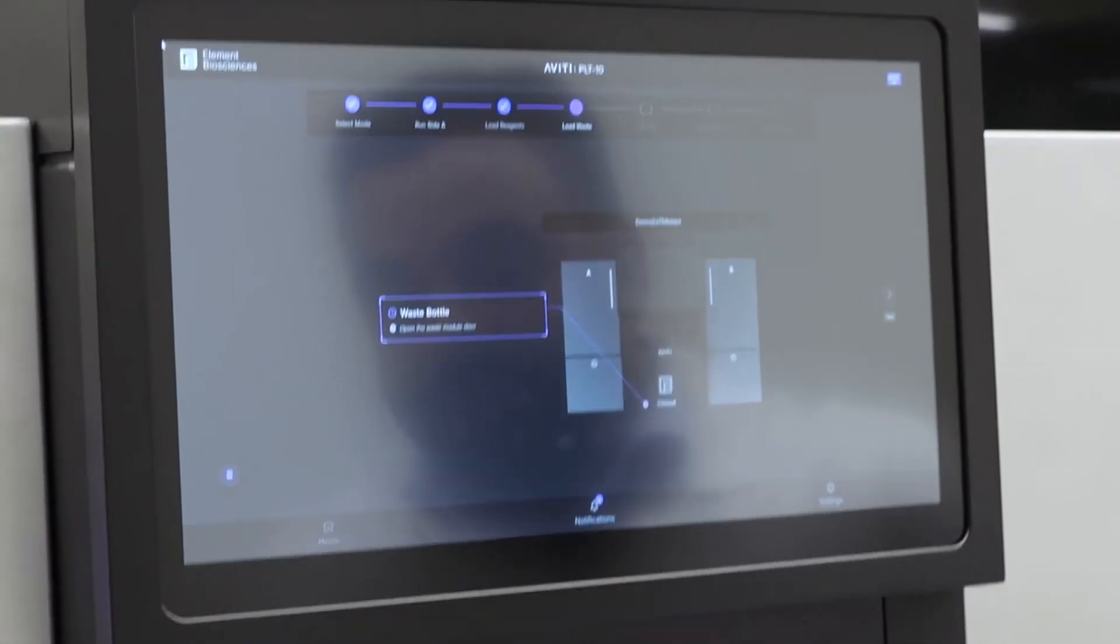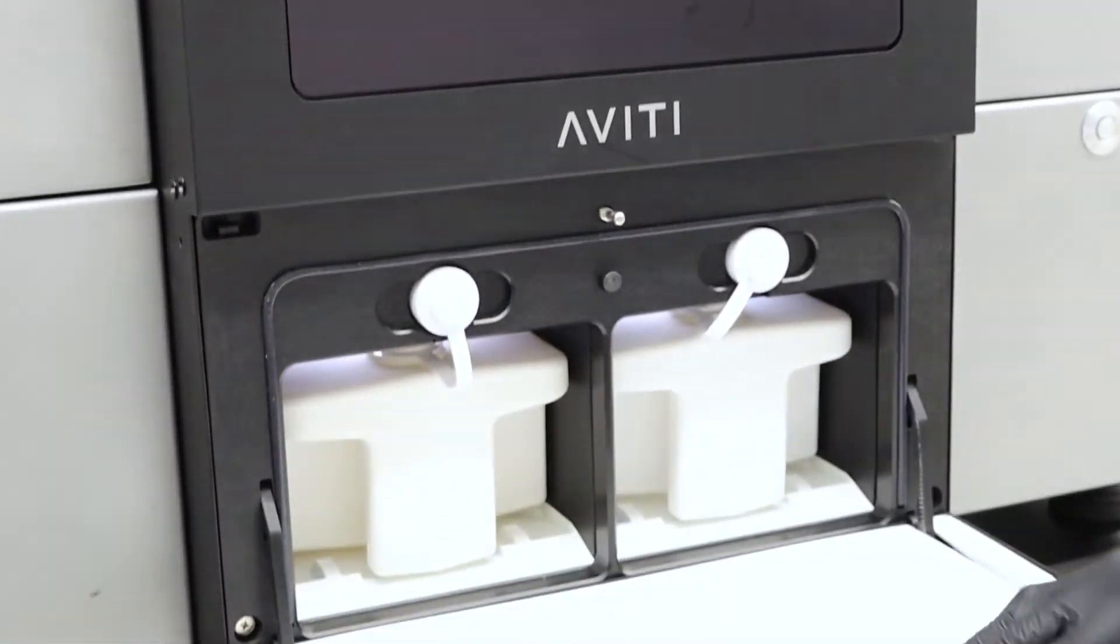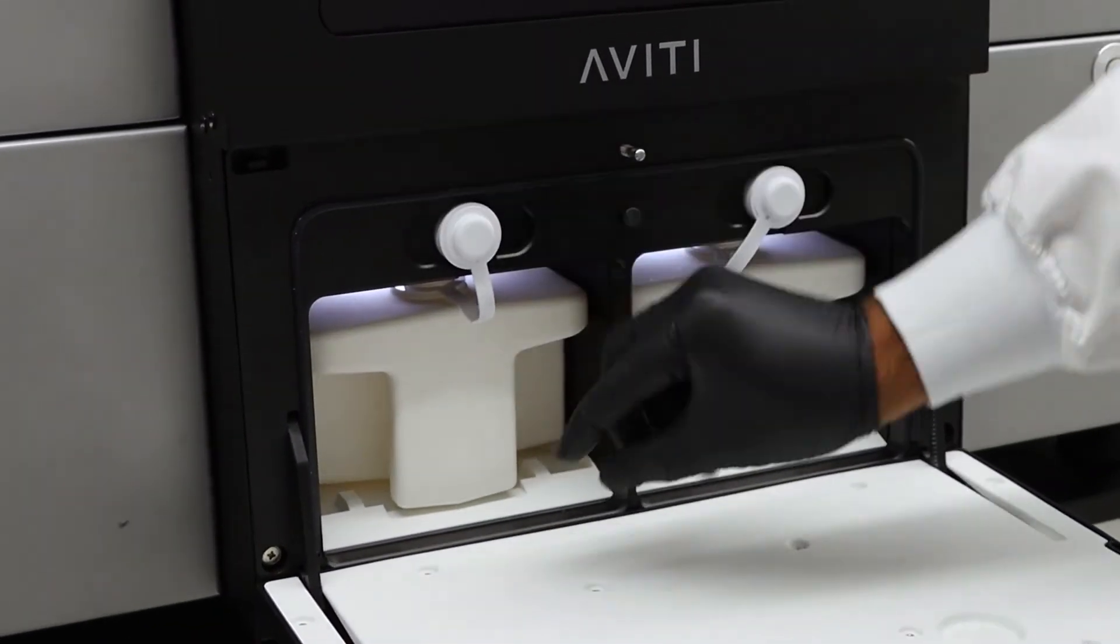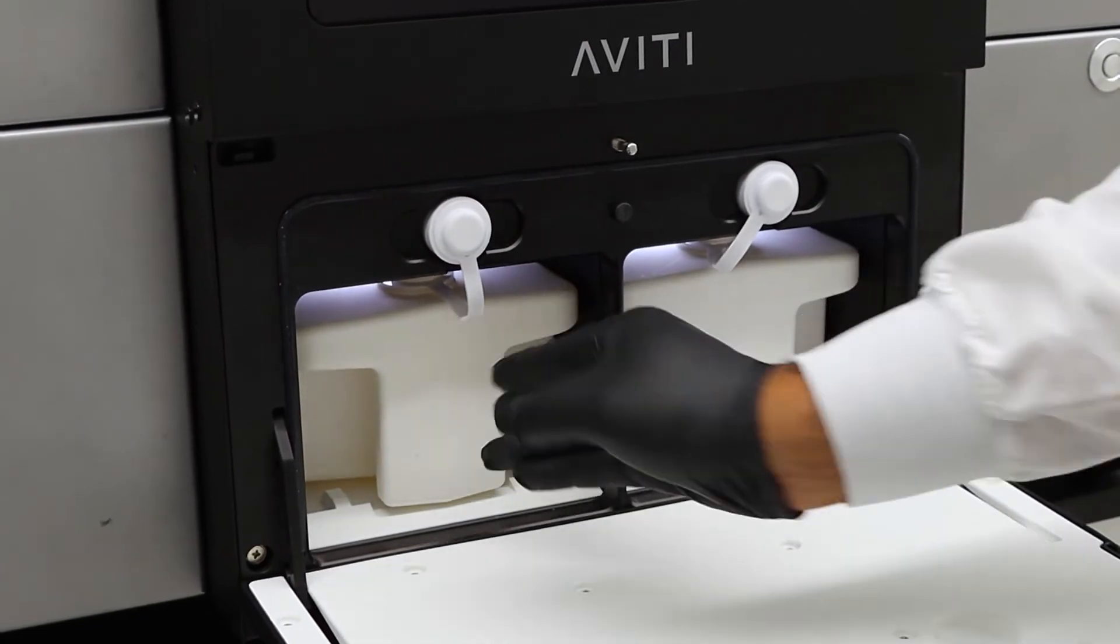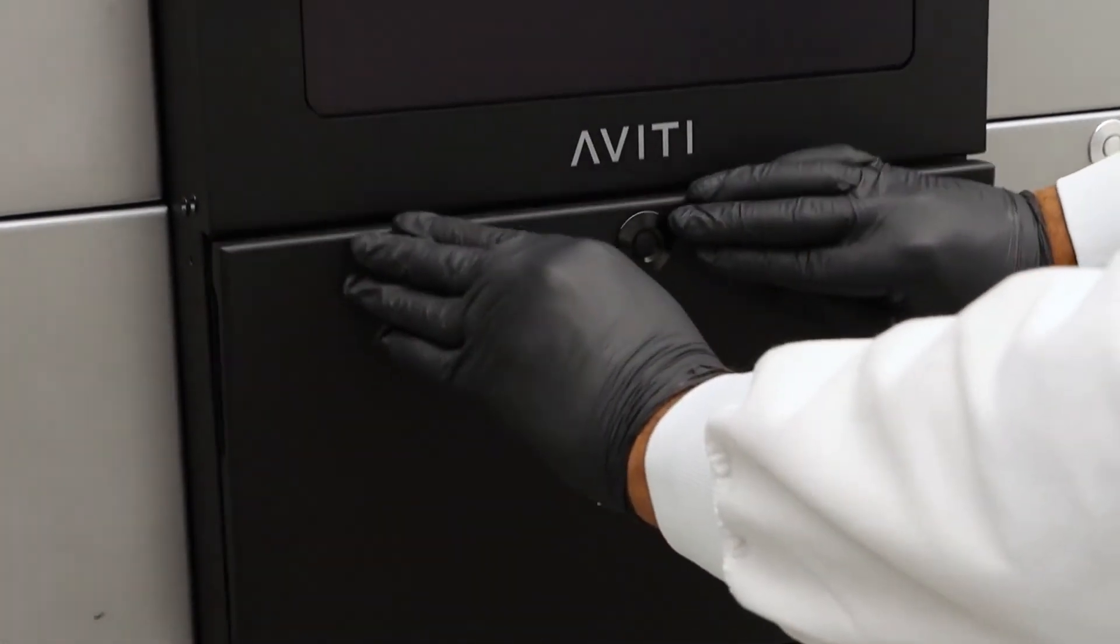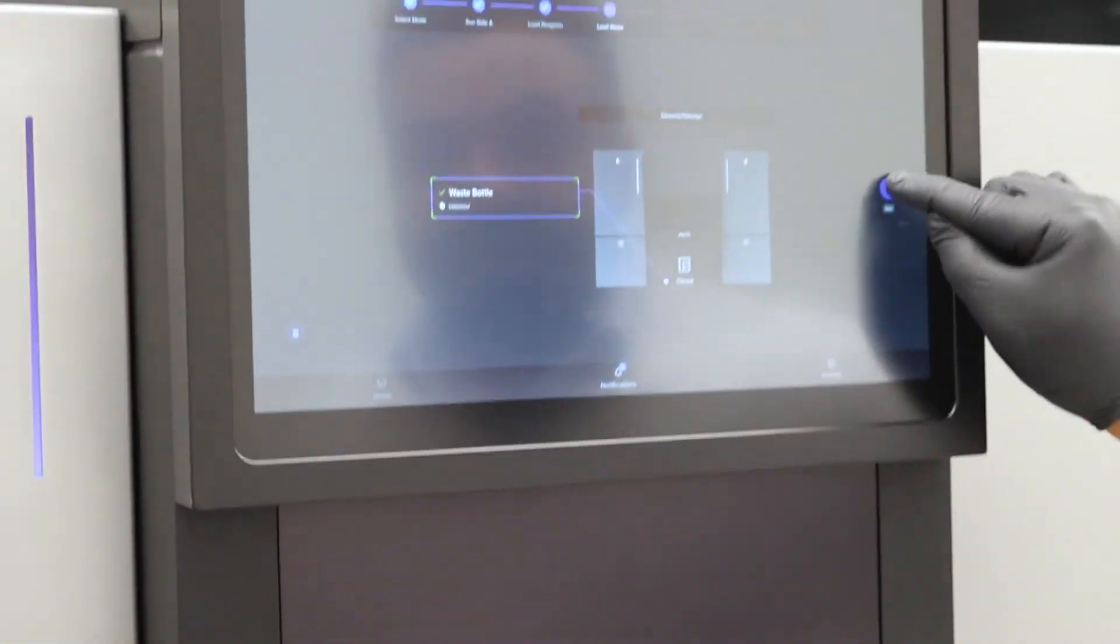You'll then be prompted to remove the waste from the existing run. You will unscrew this cap and dump out the waste, replace this bottle, close the door, and then press next.